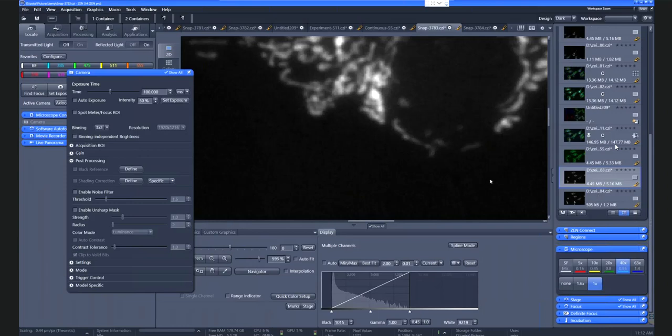Just step back, wait a second, and discuss what you really need at the end. And if we talk about live samples, definitely binning or reducing exposure time helps a lot to protect your samples and to keep yourselves happy.